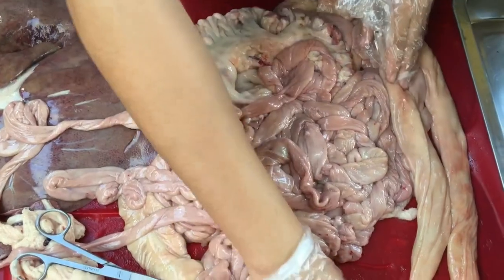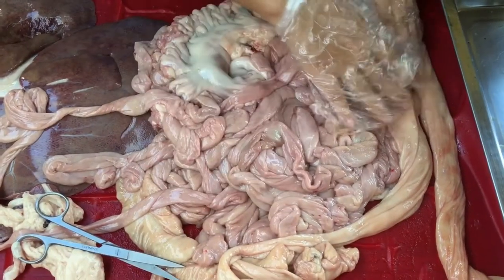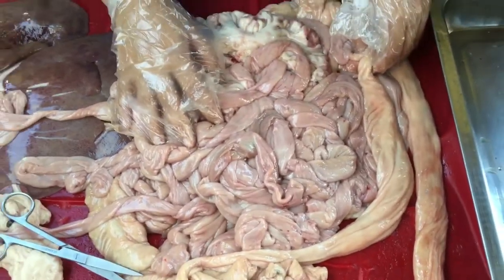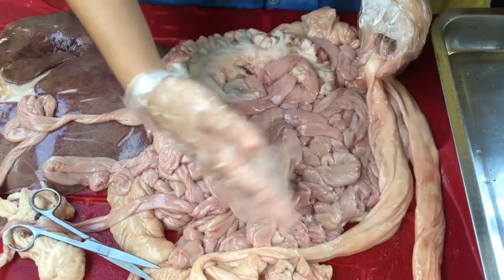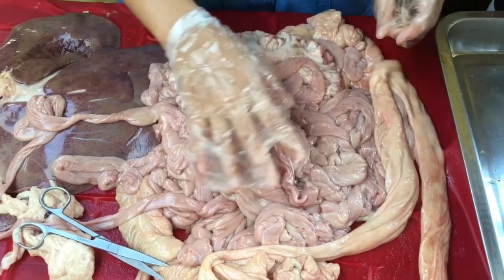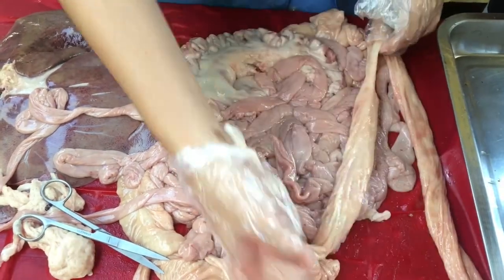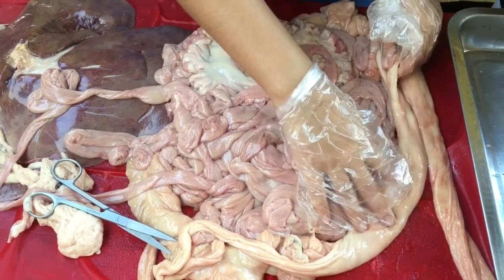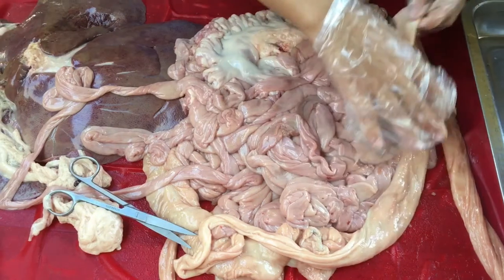Now we will move to the large intestine. The large intestine is the primary site of microbial digestion. The microbes in there have been metabolizing. That's why you see there are bubbles, and now you can see them because the stools are not here anymore. They are not present anymore. And throughout the tract there is really constriction in it.